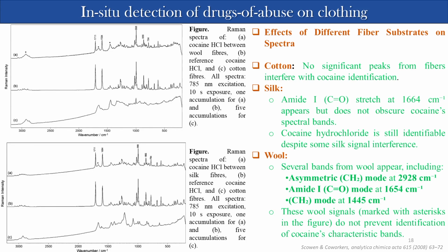Because this will be used for real purposes. If you say that this lab can detect the drug in a crime scene, then police will come with a sample, say a woolen sample. If you have not studied previously, if you do not have a database, then you cannot accept the sample. You cannot use a woolen sample when you just have a data set for the cotton one, because you are going to help police in convicting somebody.